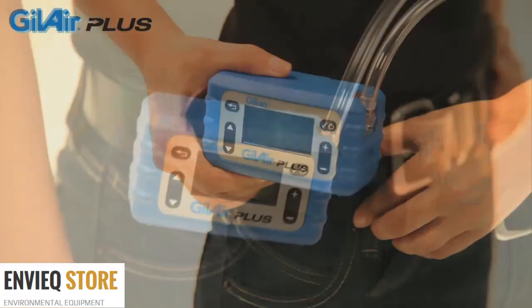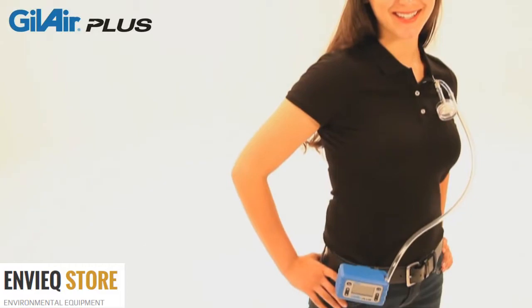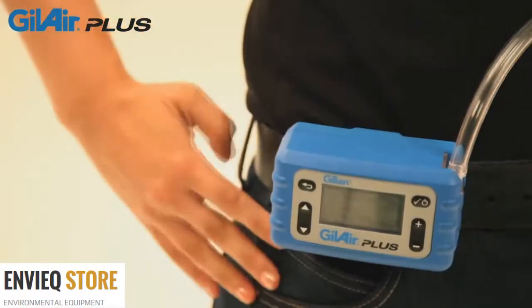GillAir Plus has unmatched versatility. It meets the requirements of more applications, provides multiple language and international functions, and automates more tasks to save you time.